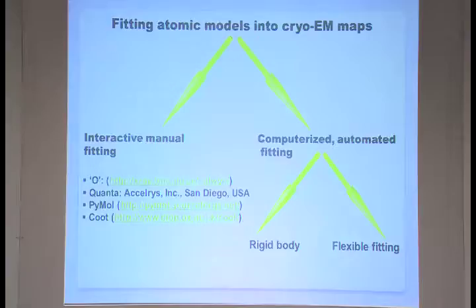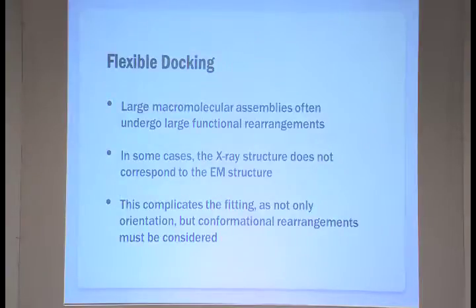Now, if you have a map better than 5 angstrom, Professor Garib's software is there, you can use that. But if you get a 7 to 15 angstrom map, there are still some ways where you can generate quasi-atomic models. I'll describe a few of those methods, definitely as a user, not as a developer.